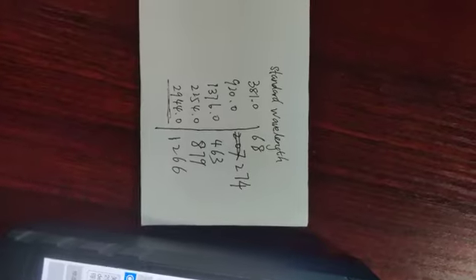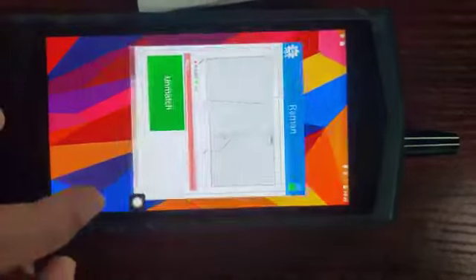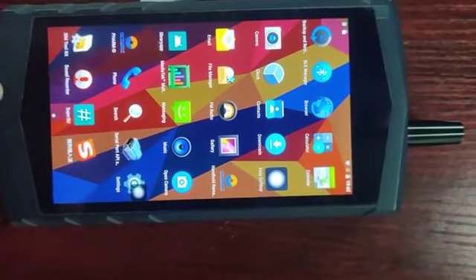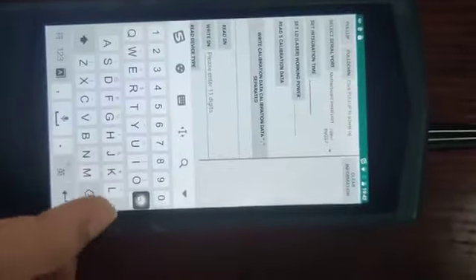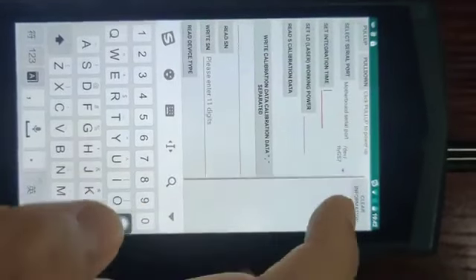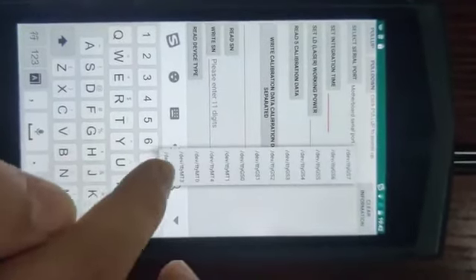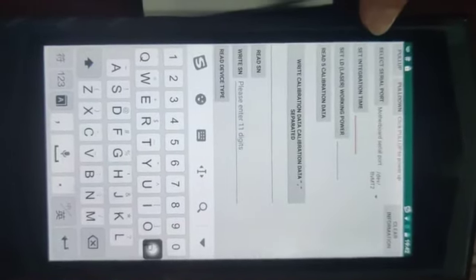You need to rewrite the pixel and click here to return to the home page and click the library app. Here you need to test and click pull up, and click select serial port, the last one, and set and select.